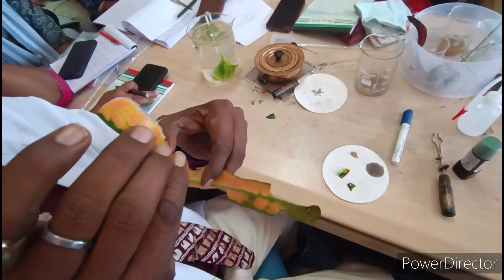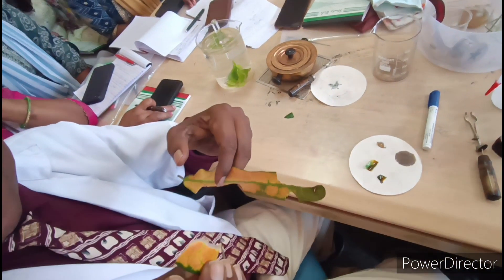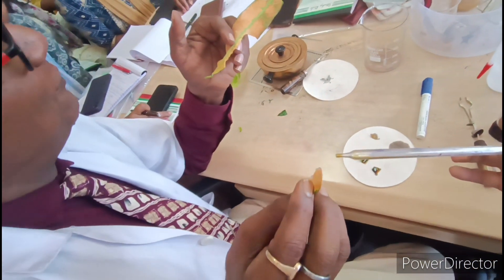This transparent layer will be cut with scissors and stained. The stomata will then be clearly visible.